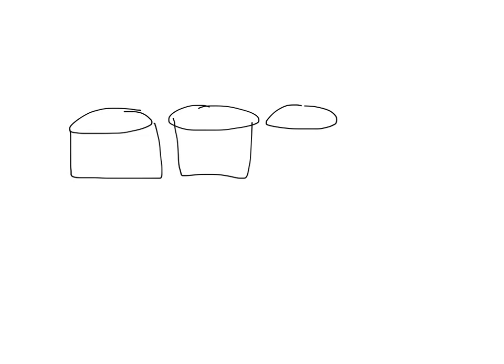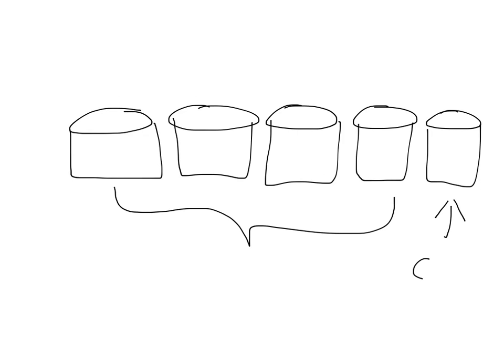Okay, you're going to be using beakers, and you're going to be setting up 5 scenarios. 4 of them, these 4, are going to be whatever you decide to pick, and 1 will be your control. You guys need to talk about what you're going to be putting into your control.